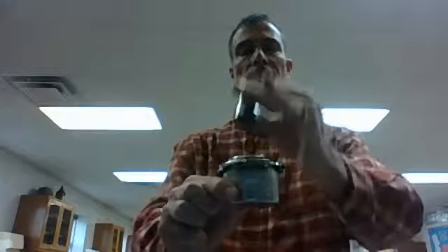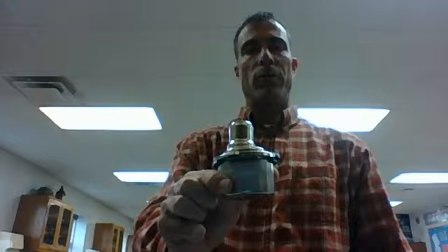Next, we have our alcohol burner. Okay, this alcohol burner has a little rubber stopper type thing in it, so the liquid in here doesn't dry out. But this again is an alcohol burner. You light this little circular part, and the flame goes up. When you're done, you simply put the cap on to put the flame out. Okay, that's an alcohol burner.